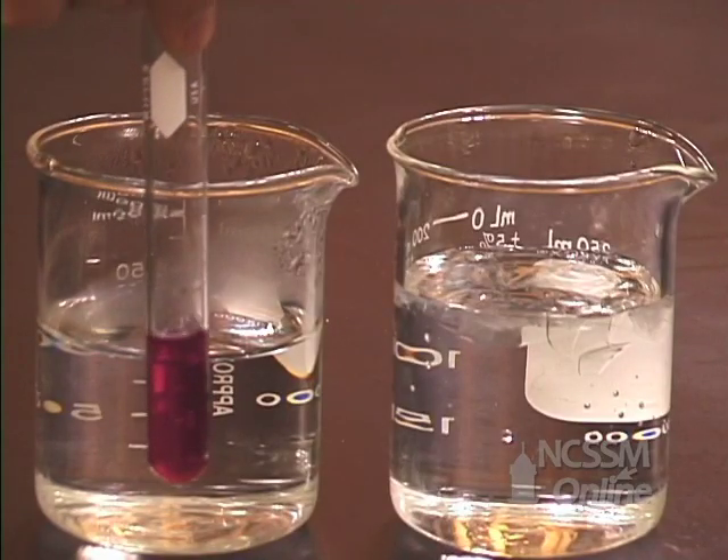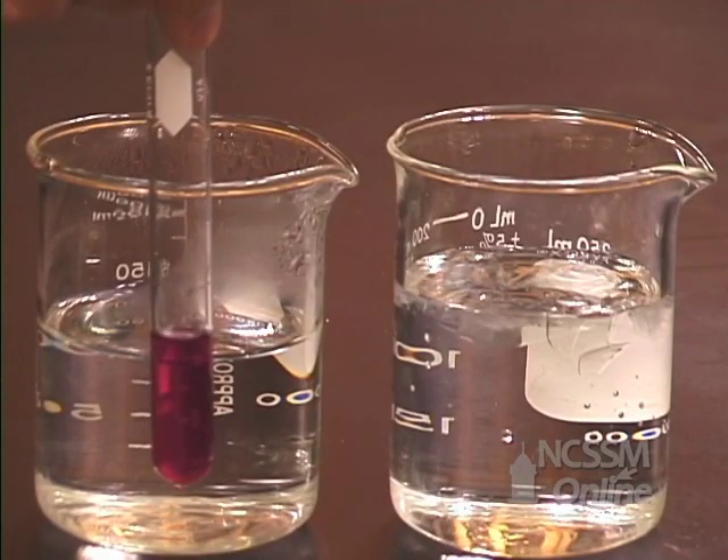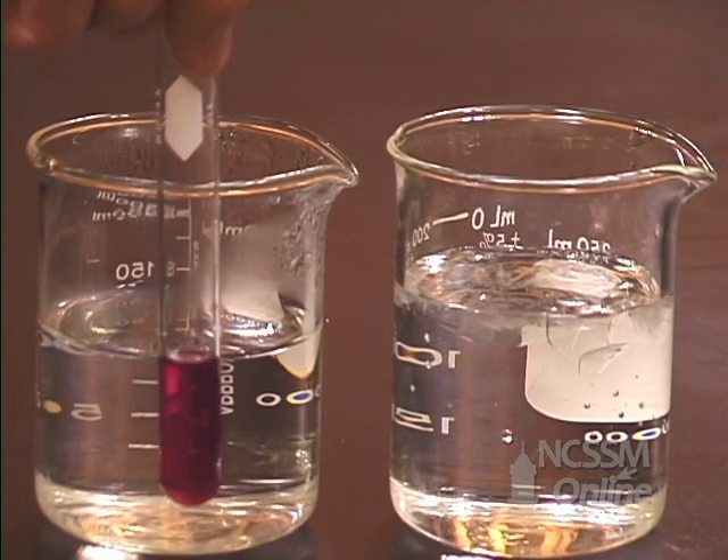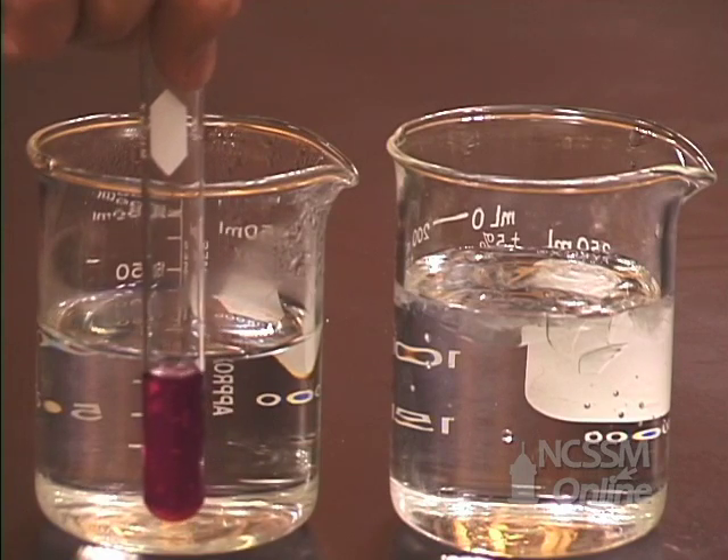We are going to take a test tube containing the equilibrium mixture. The solution is pink, indicating that we have a high concentration of the cobalt water complex ion.